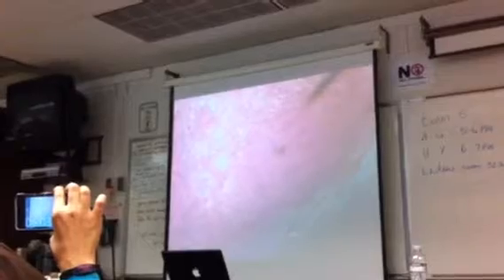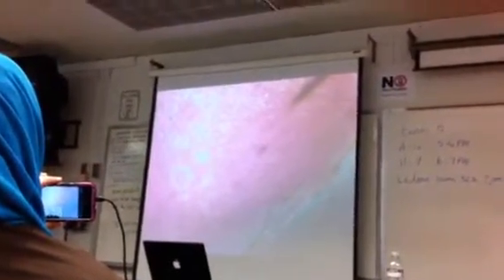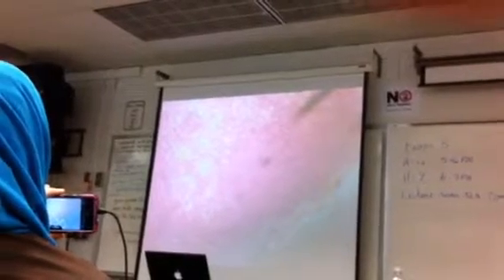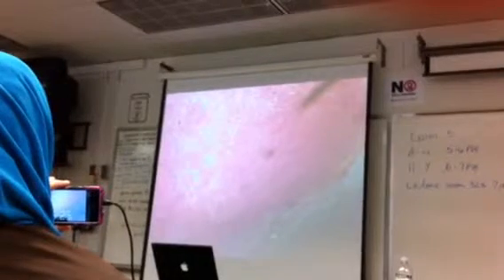It could be, where's the microscope? I didn't notice when I was talking on the slides that there seemed to be any pulsating, so it could just be the microscope. I'm hoping, because if the bulb goes out, we have to migrate into the other room.